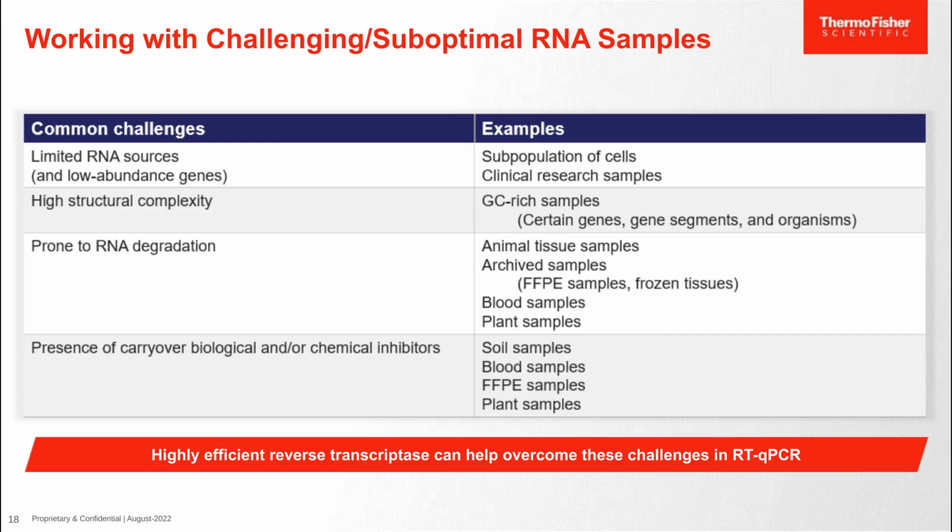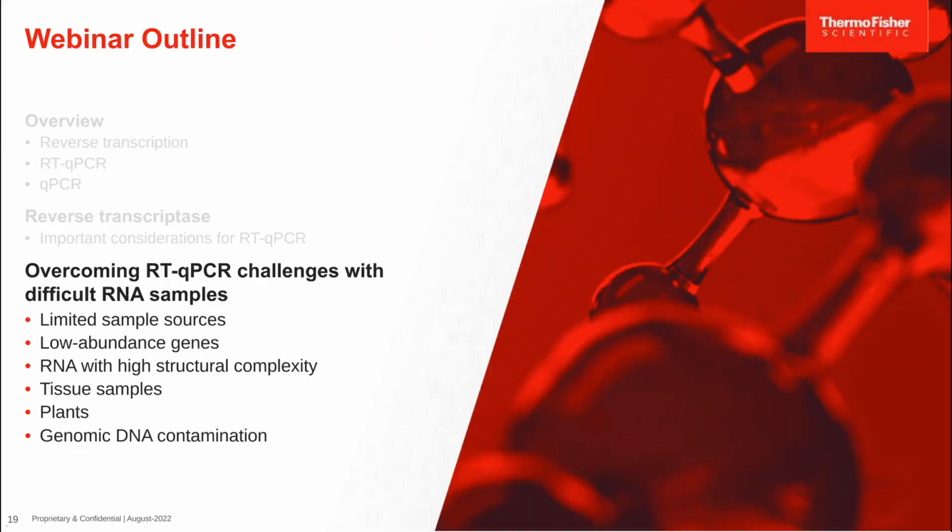In the coming slides, I will show some RT-qPCR data when working with these challenging samples and discuss how highly efficient reverse transcription reagents can help you to achieve high quality data. Before we get into that, let's first discuss specific ways to overcome RT-qPCR challenges when working with difficult RNA samples.